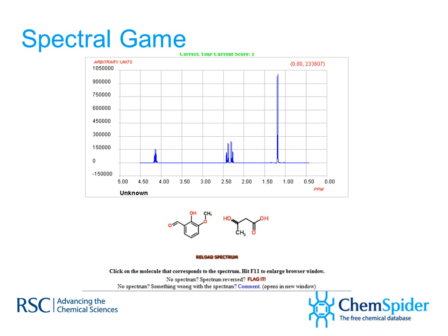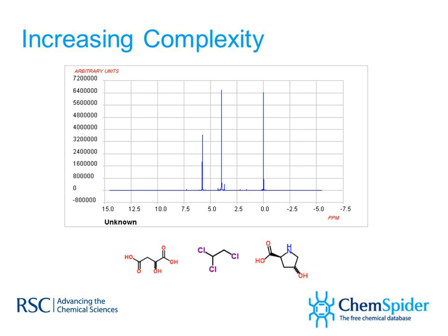So is it likely, without having aromatic protons, nothing down around 7 ppm, is it likely it's this compound? No. So you would select this structure and it would give you a score and take you to the next spectrum. After 10 of these pairs, then it moves into 3 structures, and then it gets increasingly complex to 4 structures and 5 structures, and then you have a time limit. It's a great way of learning the spectra.